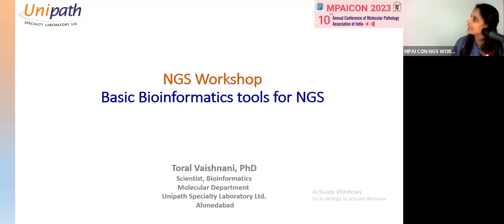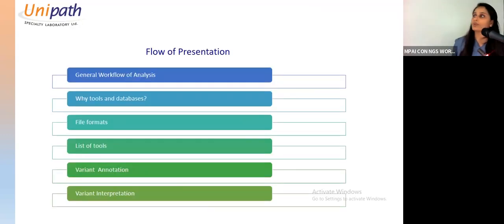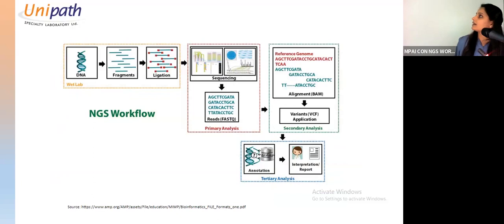Your topic is again NGS, so it covers everything. But as we are from the diagnostic field, this presentation concentrates more on the tools which are used in the field of diagnostics. So what I'm going to cover is a general workflow, tools and databases, a list of tools, variant annotation, and the hot topic, variant interpretation. This was the end of a session where he told us about the basic workflow which is followed for the analysis.